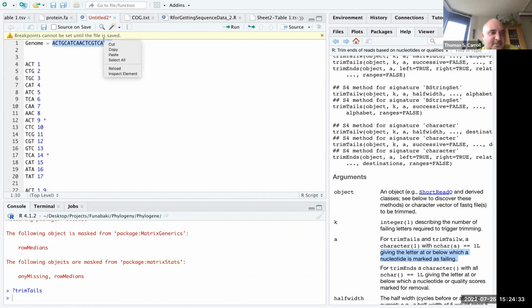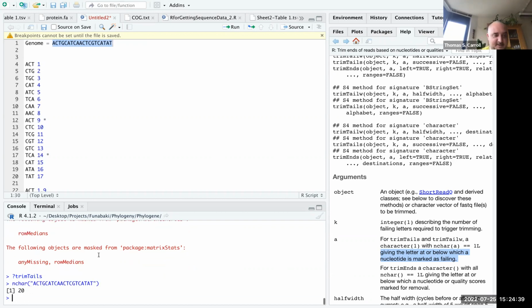So given our genome, 20 base pairs long, we're going to then index that. Starting from our first position, if I'm using an index with my k-mer set to 3, I'm going to start off by looking at the first 3, and I will make a mark in my index, and I will say I have ACT at position 1. I will then work through this, CTG position 2, TGC position 3. This is what the computer will be doing when it's building an index. And every so often, it will come across something it has already come across, right?